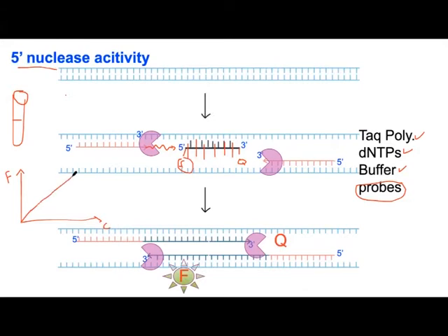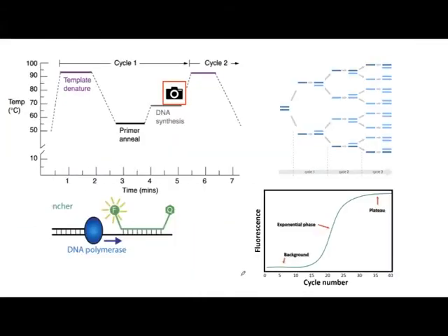It appears to be linear. But again, because of the CCD camera and because of the fluorescence saturation, you're going to get an S-curve like with SYBR Green. So again, if you're using a fluorescence molecule, you tell the camera of the machine that at the end of the cycle, I want to measure the fluorescence of this fluorescence molecule. For example, this is the VIC.